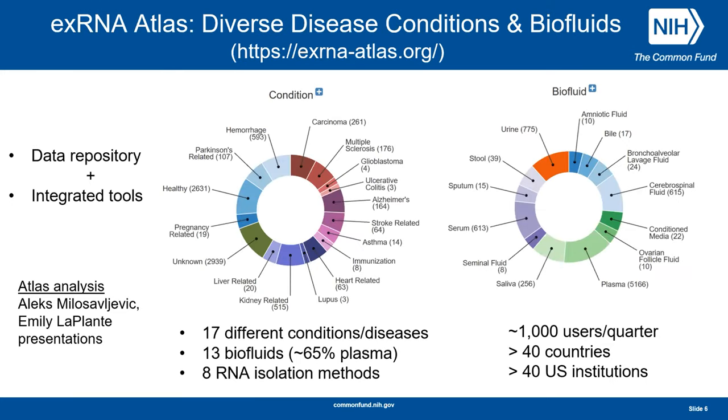This is a snapshot of the Atlas, so one can go there and do queries on various fields, so condition or biofluid. So it's not just a data repository, there's also integrated tools. Alex and Emily will cover a number of those over the course of the workshop. Rob spent a little time talking about the RNA isolation methods, which again, there's a lot of work done on that, and also one can query on that.